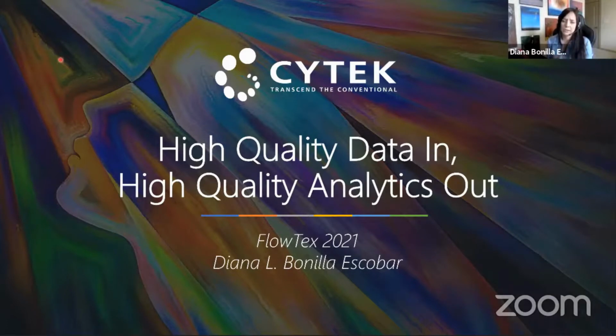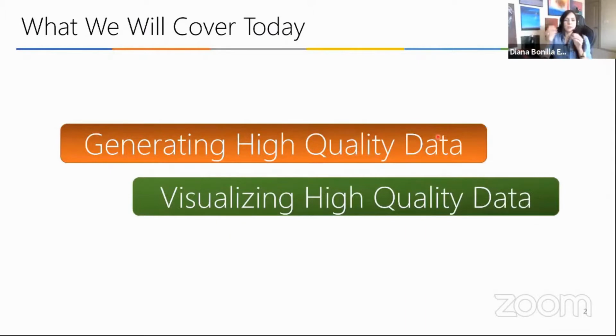But the key point for the talk, at least my part, is that before you even think about the different computational analytical options that we will see later, you need to make sure that you have rock solid data that you can trust, that is reproducible, and that's again the main goal for today. I'll review 2 steps that you need to follow before jumping into any computational analysis. First, guidelines on how you can generate good data, and especially how to assess the quality of your data. And then a few background slides on computational cytometry before we hear more from Tim and Ryan.